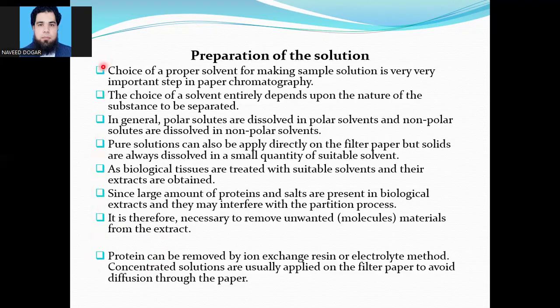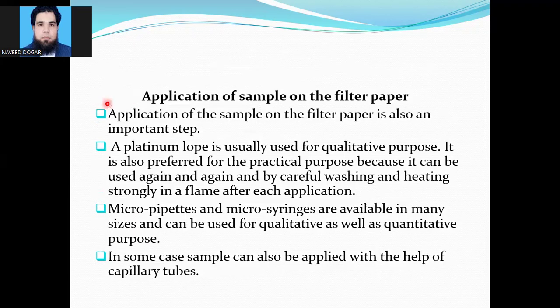But if we want to make a general separation, for example, the separation of a mixture of inks or a mixture of metals, then we have to dissolve the solute in a proper solvent, and that is basically the sample.